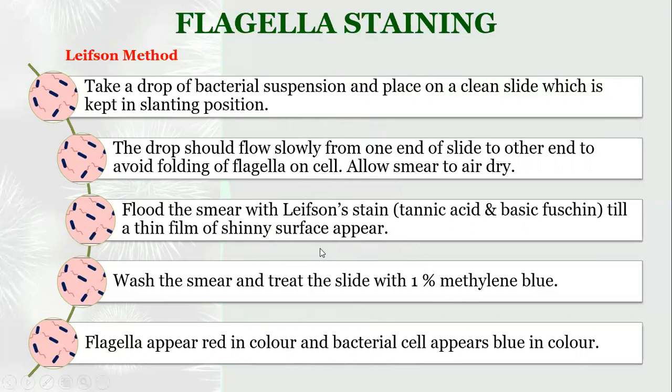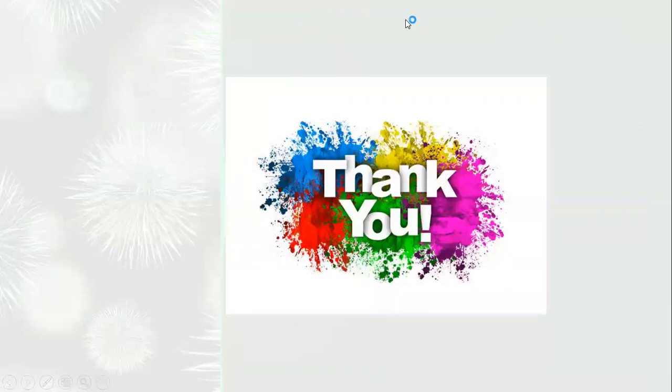This is flagella staining. And these are all the techniques used to identify microorganisms by staining techniques.